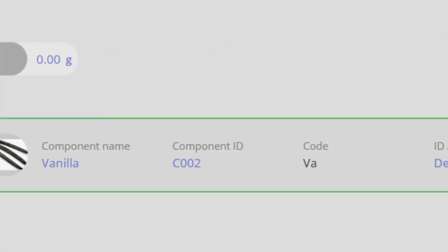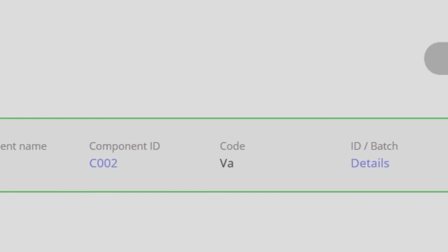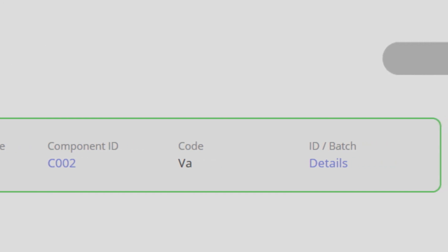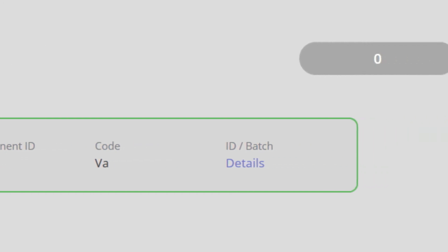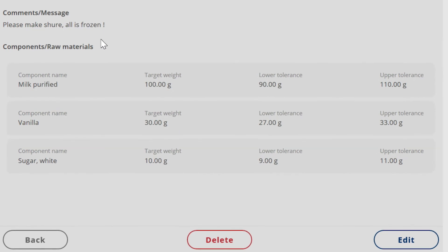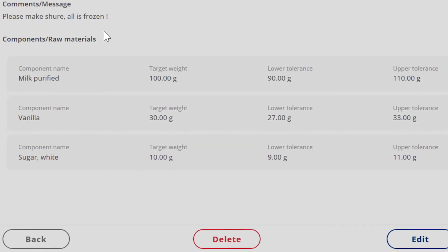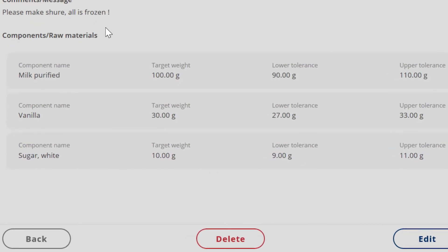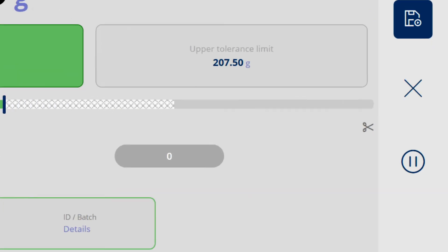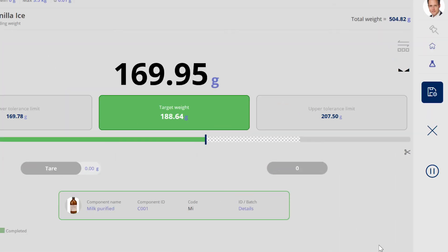Free batch information can be entered for each component or for the result recipe. This information is stored with the recipe in a tamper-proof manner. A recipe can be paused and recalled later, and a formulation can be carried out on several scales.